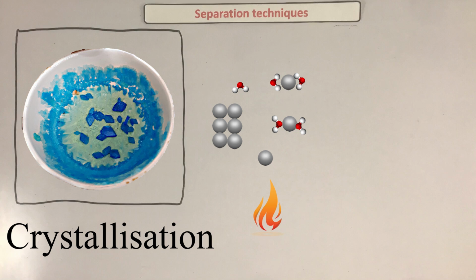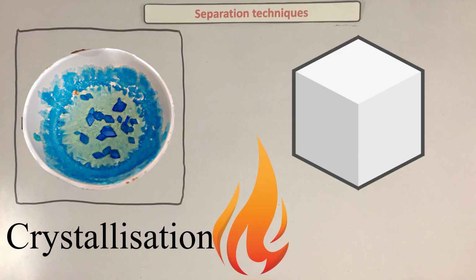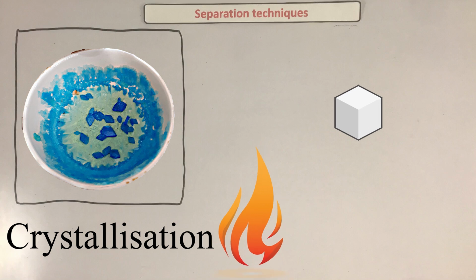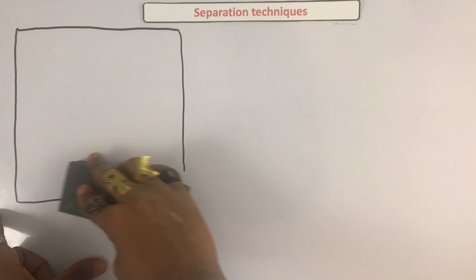That's because water has a lower boiling point than most of the salts. I think all of the salts have a higher boiling point than water. However, there's a bit of a catch-22 here. That is because the quicker you crystallize your salt, the smaller your crystals. Therefore, if you want large crystals, you need to be very careful and heat your solution gently. Also, only boil away about half of the water and then leave the rest to evaporate overnight. That should ensure that you get large crystals.